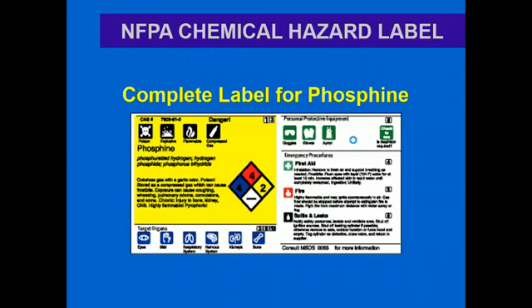If you want some additional information about the chemicals beyond the NFPA diamond notation, you can look at the label. The labels of the chemicals in the storage closet would have these types of labels on them, which give a little bit more detailed information, giving us the name of the chemical, some alternate names, and telling us if there are health issues, what organs it affects. So it'll be dangerous for your eyes, for your skin, for your respiratory system, your nervous system, etc. So it's basically pretty bad. It tells you some ways to protect yourself, and also gives us some ways to deal with what happens if we are exposed, what happens if there's a fire with it, what happens if it leaks or spills, etc.